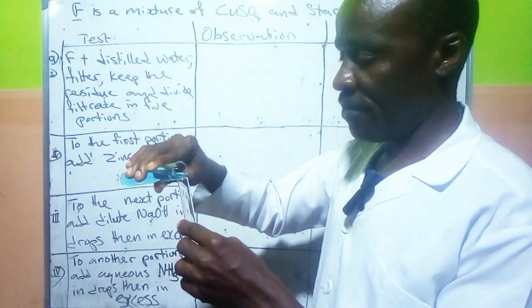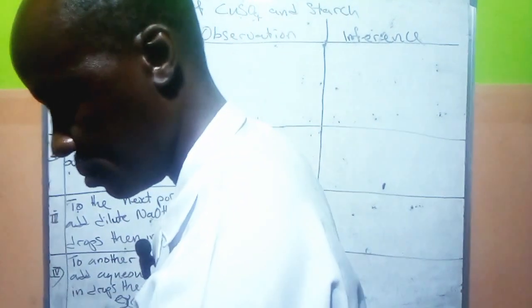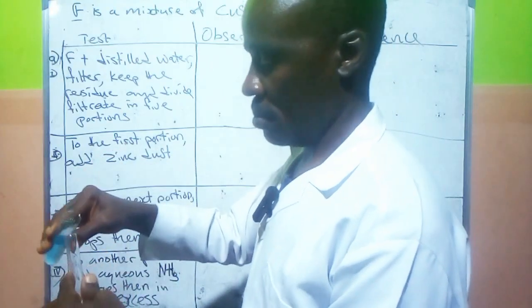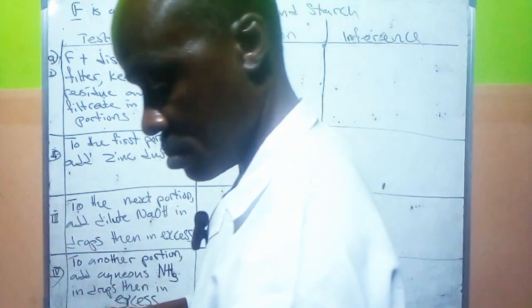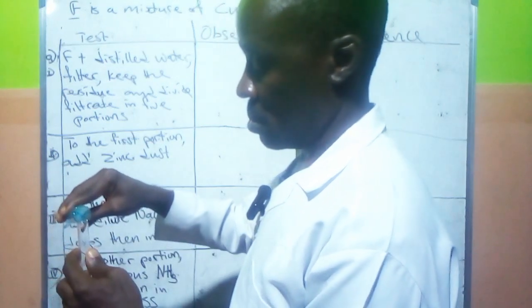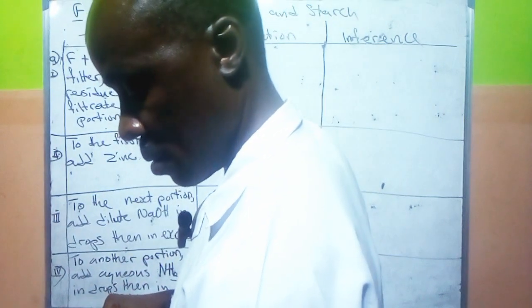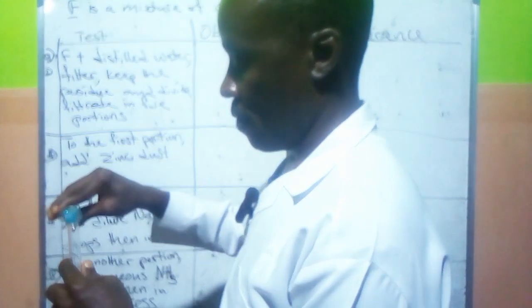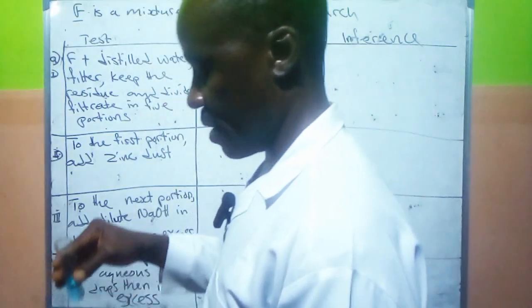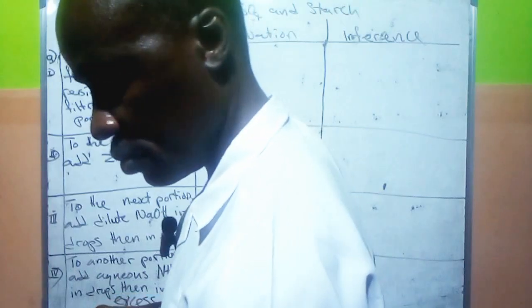I'm going to divide into 5 portions. 1, 2, 3, 4, and finally 5. So we keep our residue too.